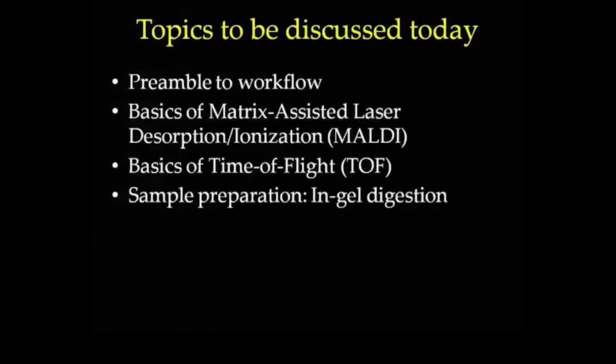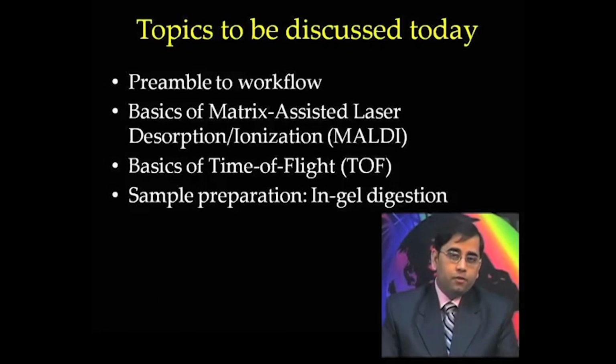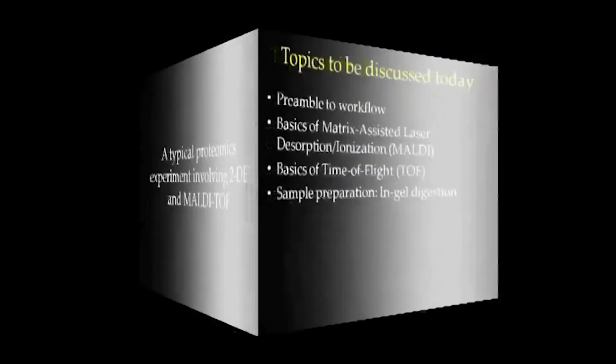So, in today's lecture, we will talk about basics of MALDI-TOF, how to prepare the sample for MALDI-TOF or TOF-TOF analysis, which will include in gel digestion. You want to do the proteolytic digestion of the samples.